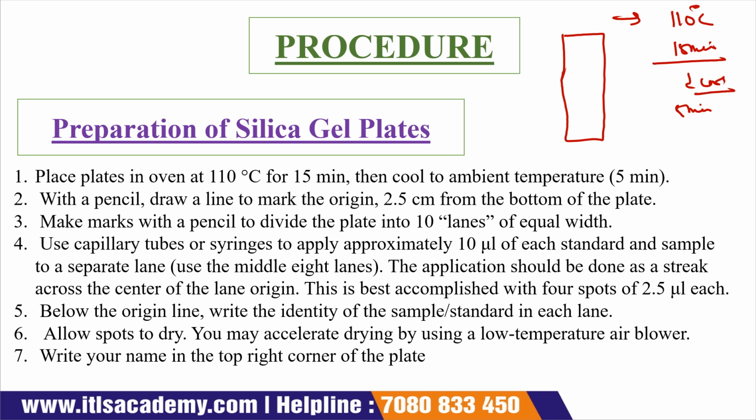Then after that, we draw a mark at 2.5 centimeter. Then again we make a mark with a pencil which divides the plate into 10 lines of equal width.